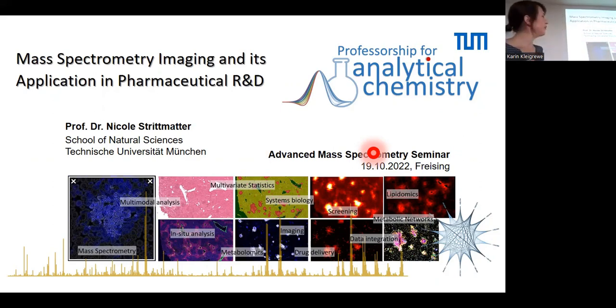And I'm going to talk to you today about mass spectrometry imaging and its application in pharmaceutical R&D. This is not necessarily what I'm doing now. It's what I've been doing in the past years before I came here.